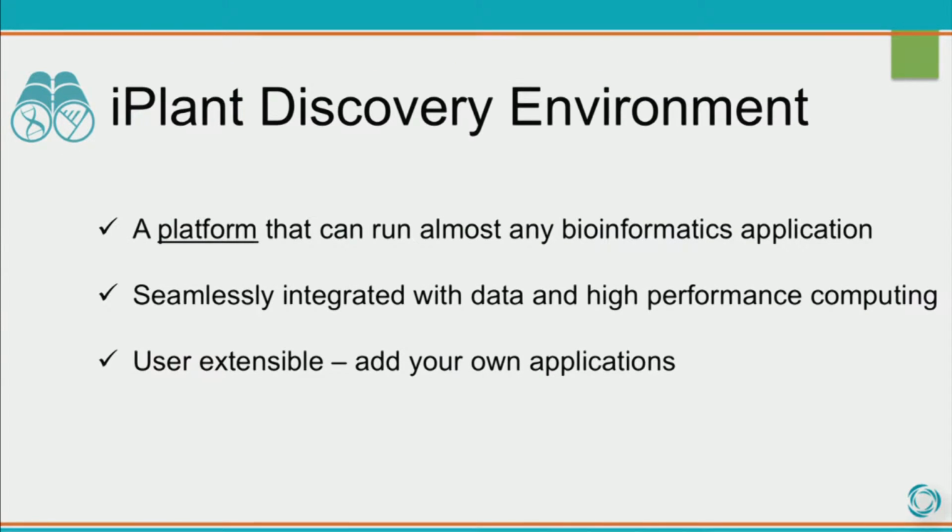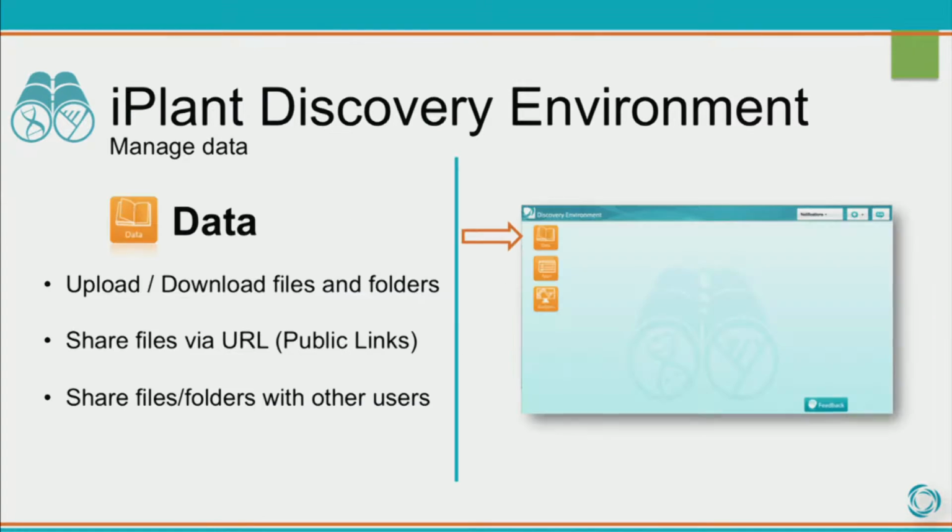The discovery environment, as I mentioned, is a platform, so you can run almost any bioinformatics application. It's integrated with our data and high-performance computing, and it's also user-extensible, which means you can add your own applications. I won't show you today adding your own applications, but it will at least get to analyzing some data sets.